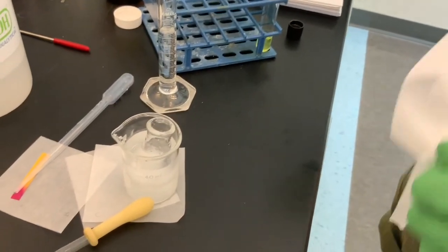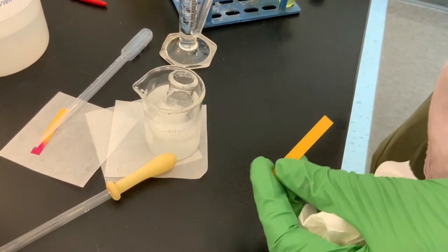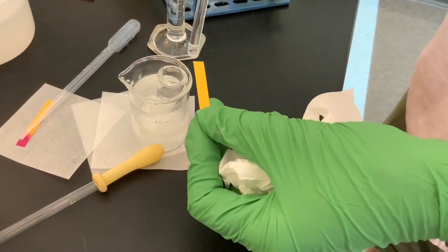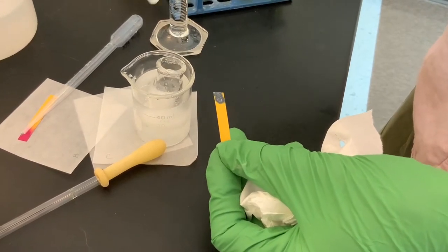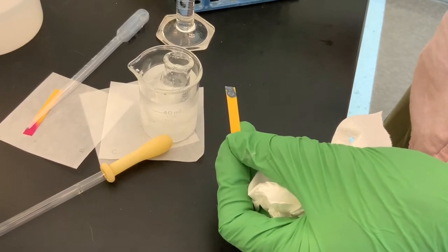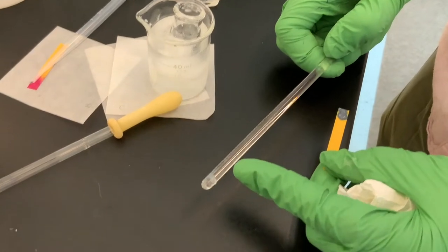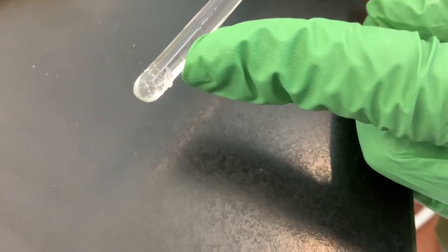And now we're going to test the pH of our aqueous layer that has now the benzocaine precipitated out. And now it's blue. And so that means I added too much base, but it's okay. This means that it's strongly alkaline. In fact, look at the tip of the stir rod. Benzocaine free base is stuck to the glass stir rod there.